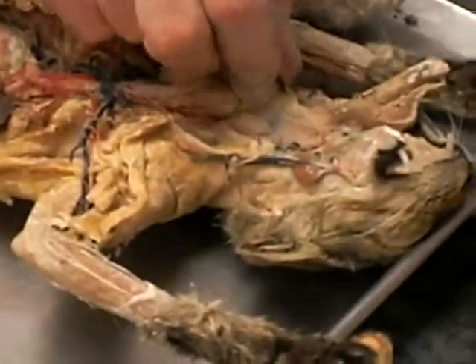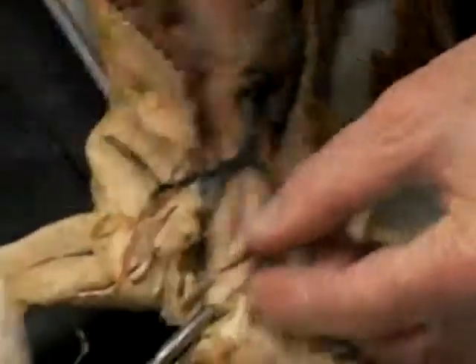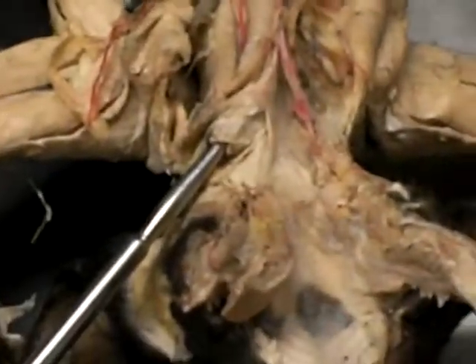That slit-like opening you see in there, and we will use the cat for this because it has a bigger larynx and more vocalization, I like this one better. This slit-like opening here is called the glottis. That is the connection between the digestive and respiratory tract.